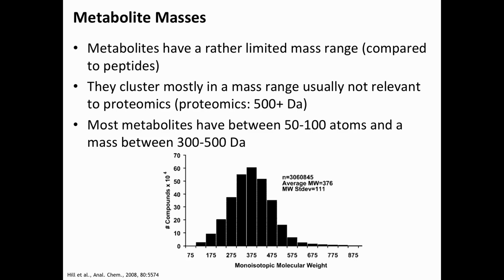It depends on the accuracy of your mass spectrometer. If you have a higher accuracy, you can narrow it down to one composition. If you have lower accuracy, you end up with hundreds of candidates, because you might have more compositions that match your accurate mass.